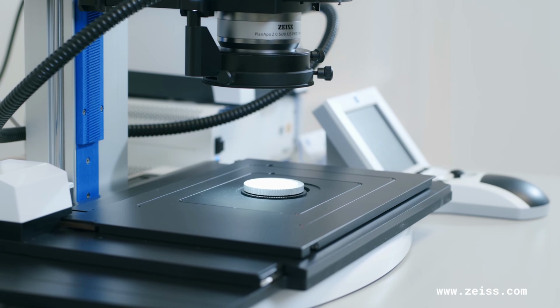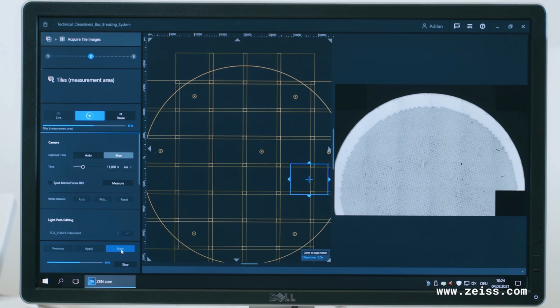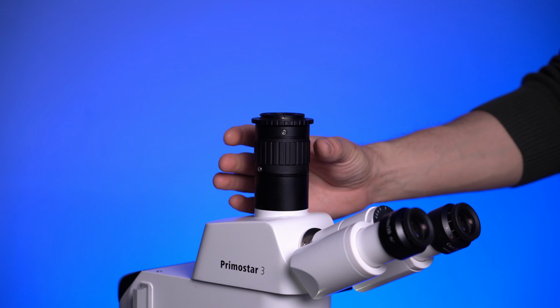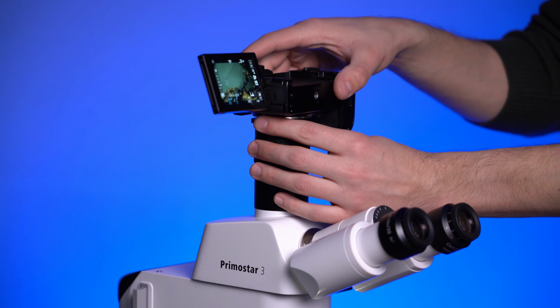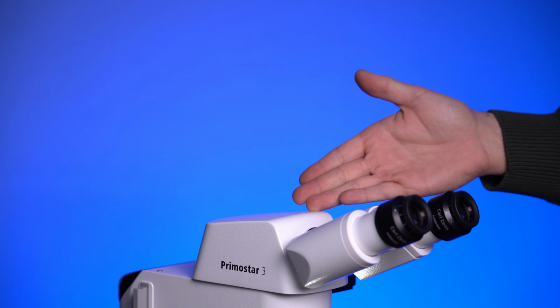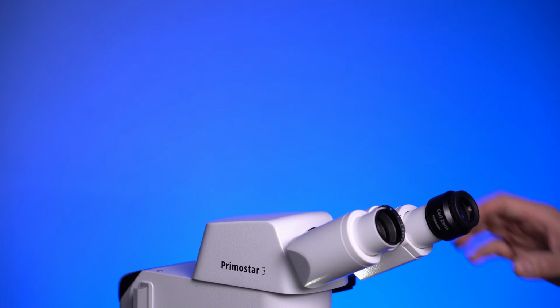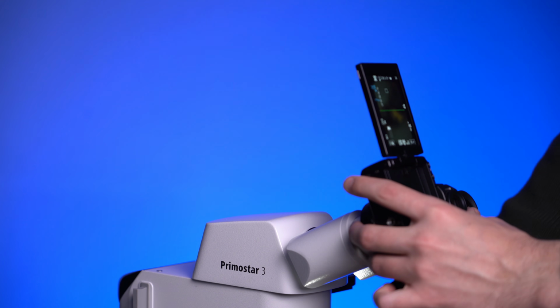Specialized cameras only make sense when the microscope is software controlled, motorized and supports measurements and image stitching. That's awesome, but way out of this budget. A trinocular tube is a nice option. Its main advantage is usability, but even the cheapest one costs extra money, so if you have a binocular microscope, don't worry. All you need to do is remove one eyepiece and make an adapter between the eyepiece tube and the camera mount. Everything will work just fine.